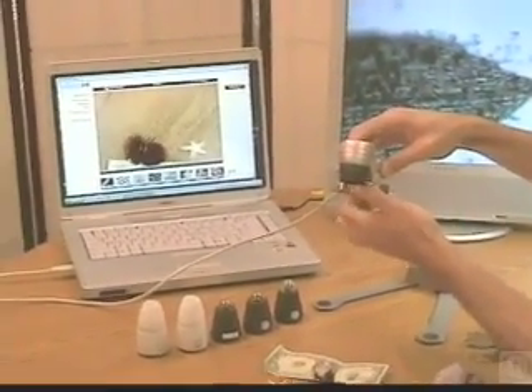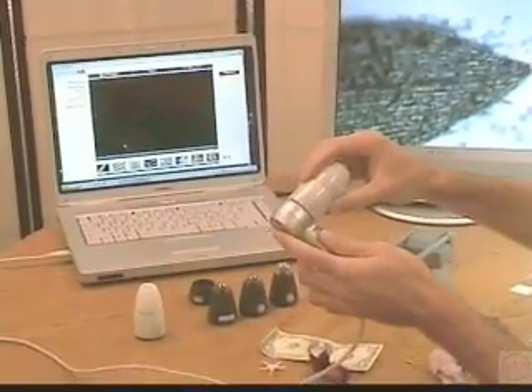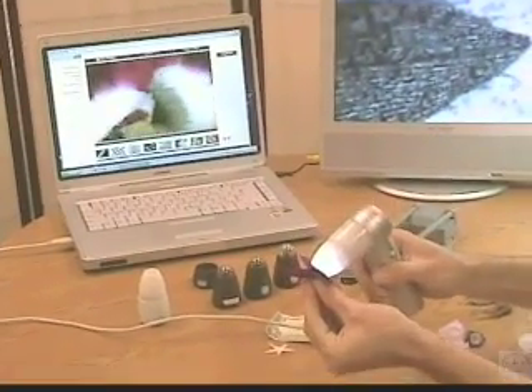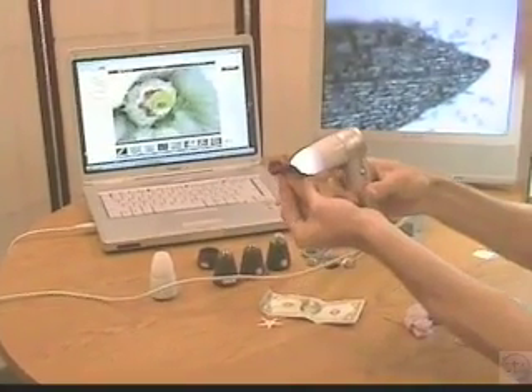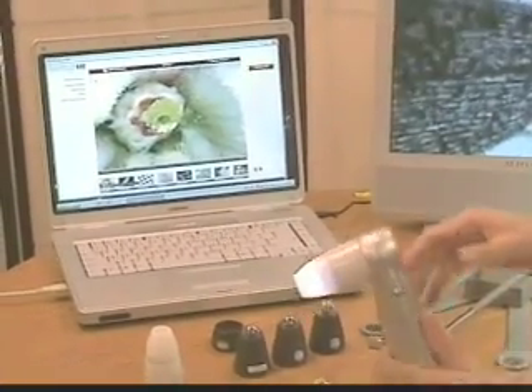I'll take the ProScope off the stand now, and I'm going to put the 50x lens on and use the ProScope in handheld mode. The lenses are easy to change. Now whatever I touch with the tip of the lens is magnified and displayed live on the computer screen. If I like this picture of the inside of the flower, there's a button on the ProScope that I simply touch, and now that image is saved right on the computer as a JPEG file.